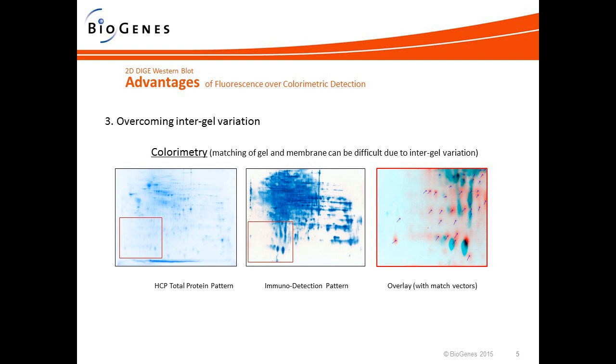And I think we're going to wrap up the questions. There's a lot of questions. These will be passed on to Jamina to follow up with you directly via email, so you will get your questions answered. But the final question for the webcast is, does the fluorescent label change the 2D pattern?